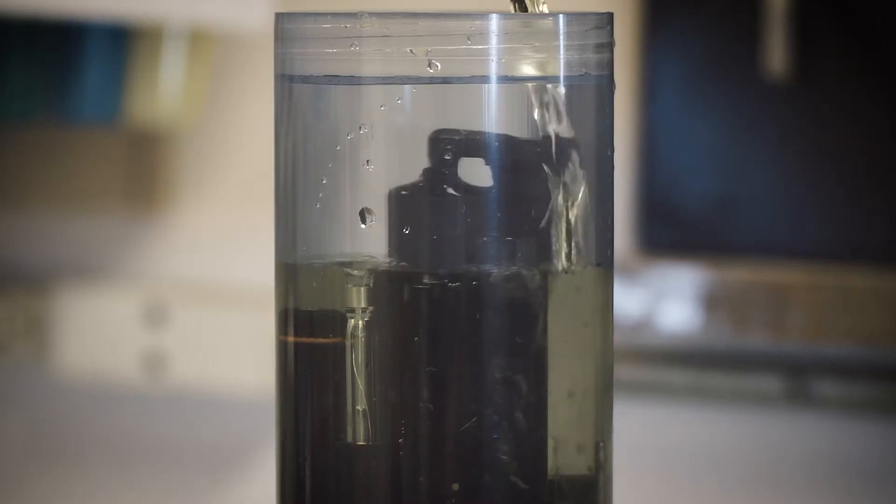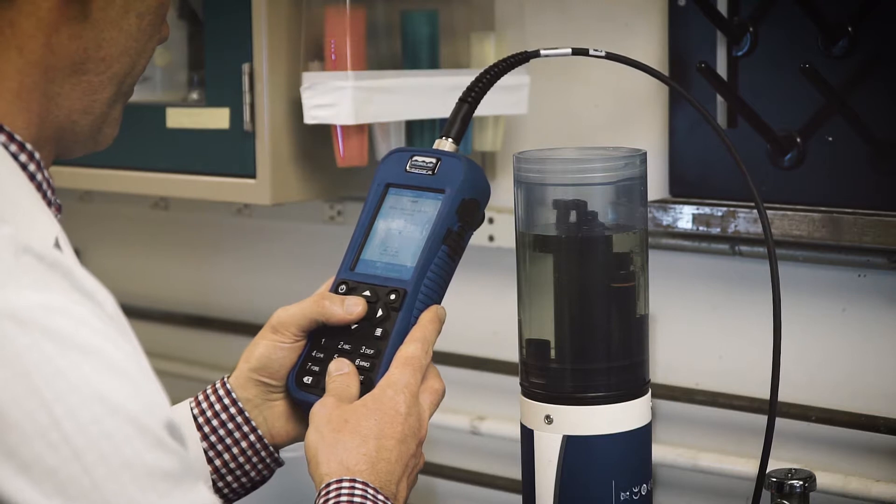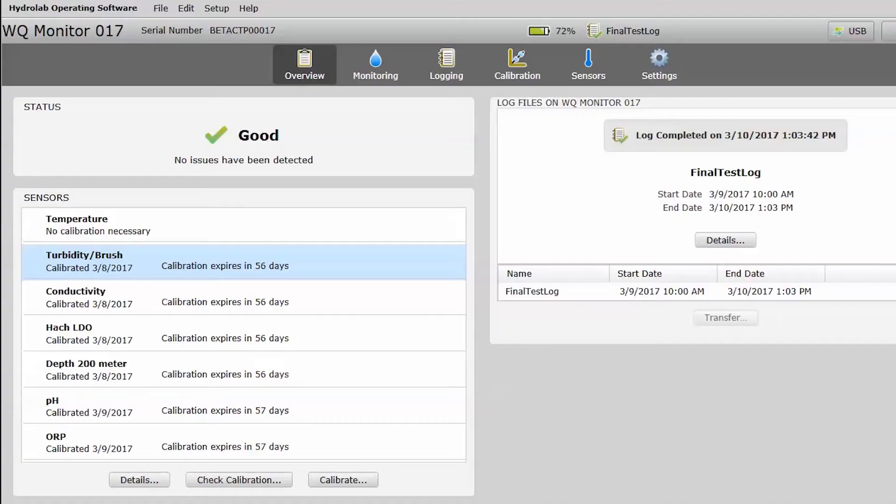You can view data, store, calibrate and configure HydroLab sondes with the handheld Surveyor HL, or view on a tablet or rugged laptop using the simple and intuitive guided software.